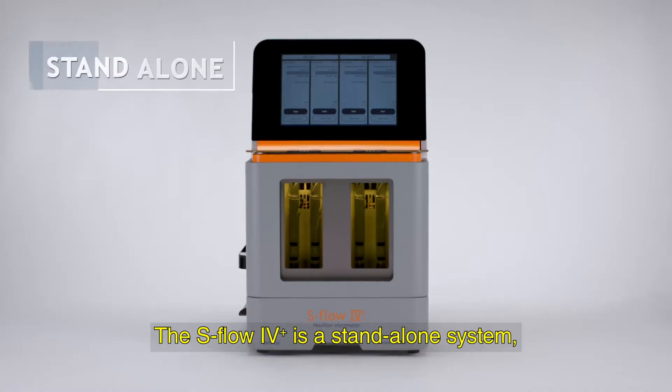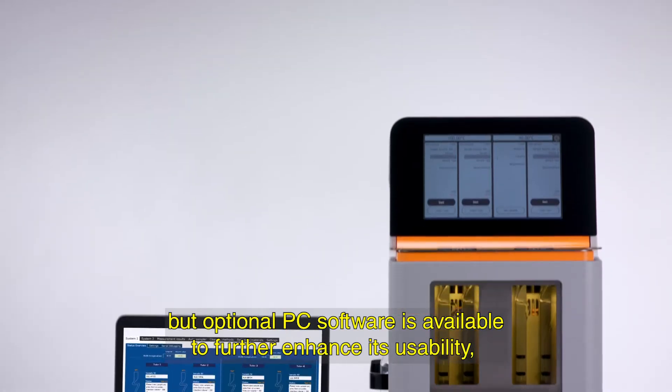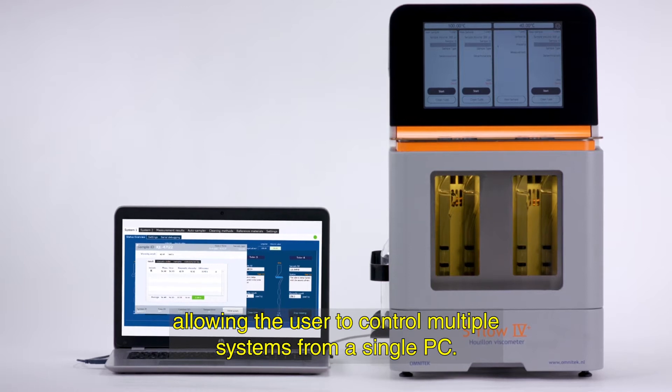The S-Flow 4 Plus is a standalone system, which means that all settings and results can be accessed through the touchscreen. Optional PC software is available to further enhance its usability, allowing the user to control multiple systems from a single PC.